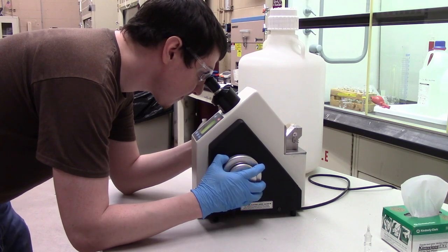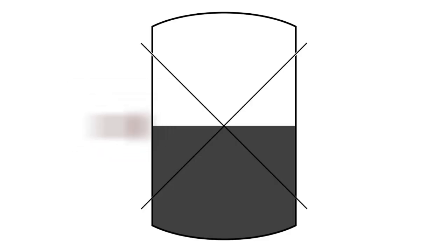Using the larger wheel for fine-tuning, line the border up with the crosshairs. If the image is blurry, you can twist the microscope lens to adjust the focus.